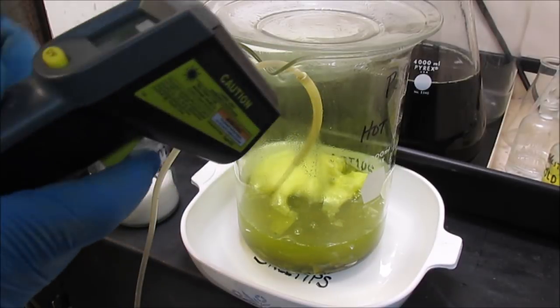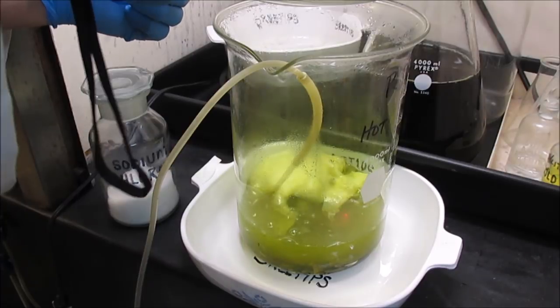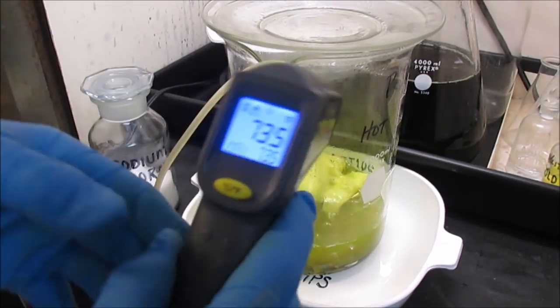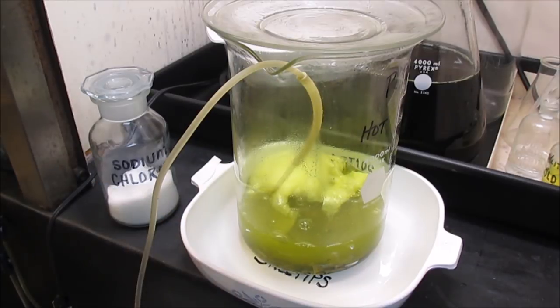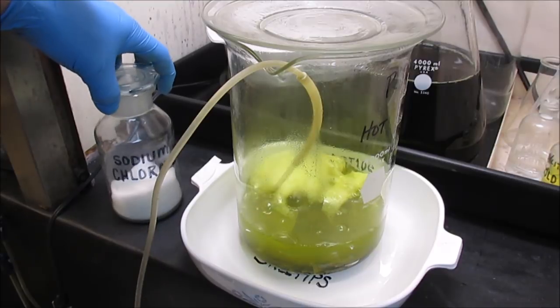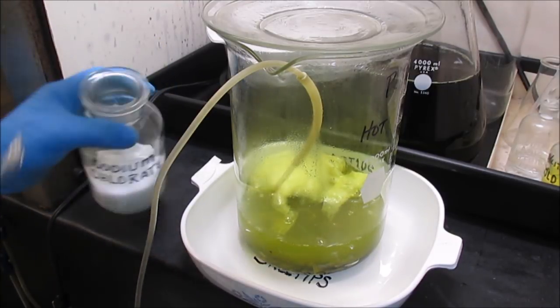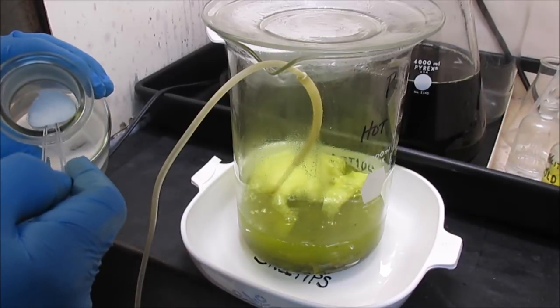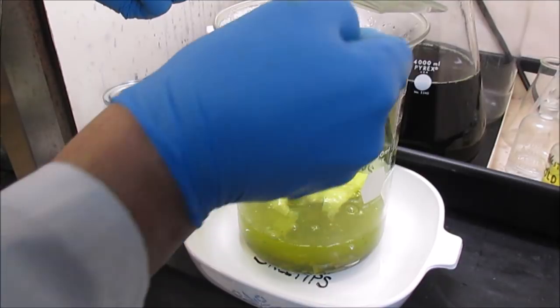Okay, we're gonna get a temperature reading here. I just added that first spoon of sodium chlorate. The temperature in there is only 73.5 degrees. What I'm going to do now, it is 1:30 p.m. by the way, I just started this at 1:30 p.m. we go ahead and add another spoon of sodium chlorate here, and we'll just let this react for a while.